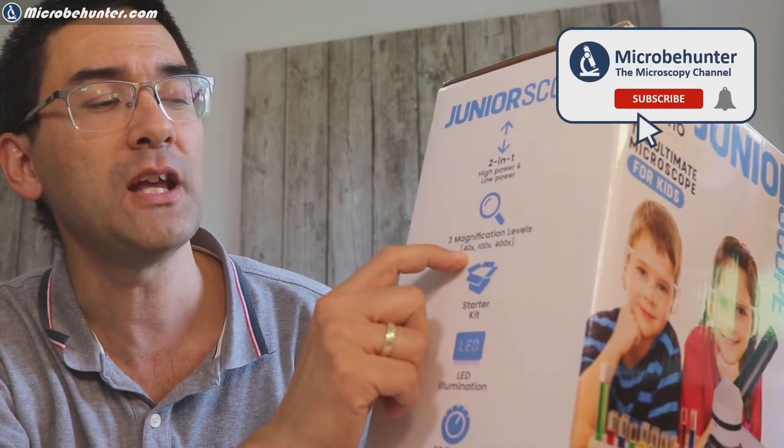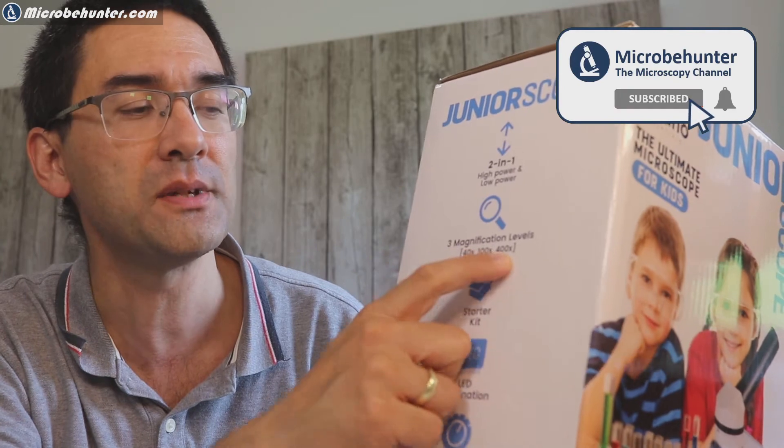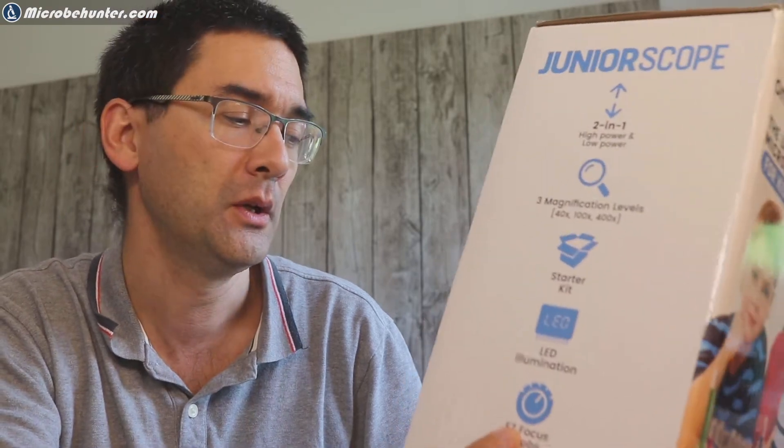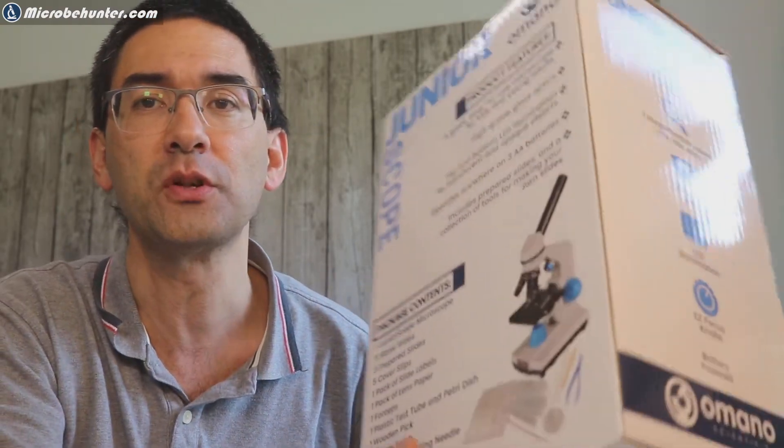It comes in a box like this and simply to show you what is included here. Total magnification of 40 to 400 times. It is an LED illumination and so it's battery operated and it has one focusing knob. And there are a whole bunch of other accessories also included.